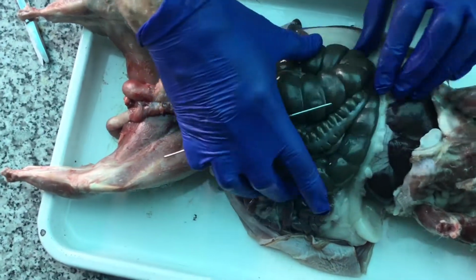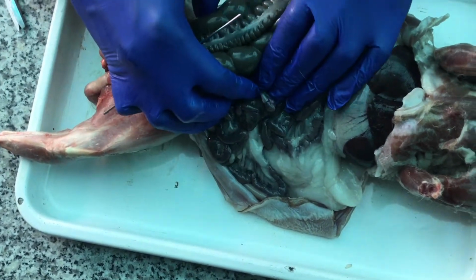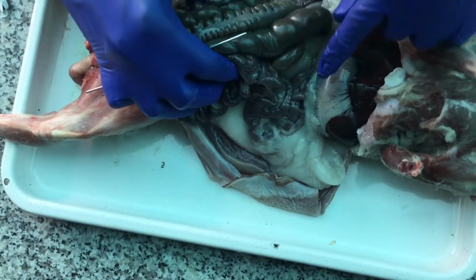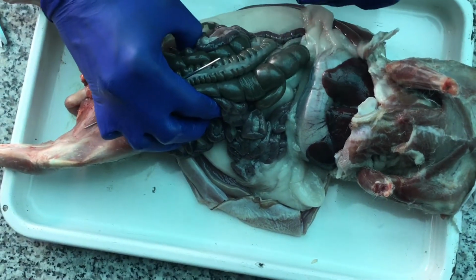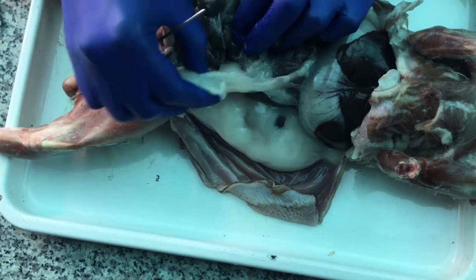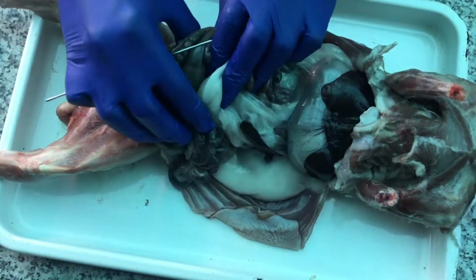Now, what I've got inside here, we're not going to worry too much about the details of the intestines, because in a rabbit, they're very much different than the human intestines, because they are strictly vegetarians and mostly eat leaves, and they harbor a whole string of intestines that are just to harbor bacteria that help them digest the cellulose in the food that they eat, which we don't have. So this is all intestines down here. You can see this is a lot of what we would call mesentery fat, or that visceral fat that we hear so much about in the press that surrounds the saran wrap lining of all of the intestines.